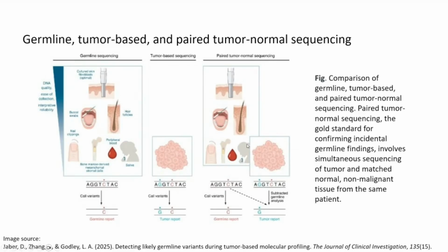One will be the tumor sample, another will be the so-called normal sample. If a patient is identified with a cancer tumor in perhaps the liver, then in order to identify the somatic variants inside the liver tumor, the samples will be collected from the tumor inside the liver. And for the normal sample tissue, ideally the tissue will be collected from just beside the tumor.